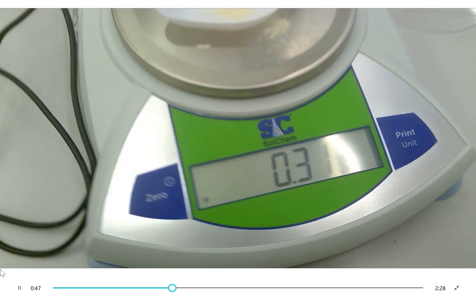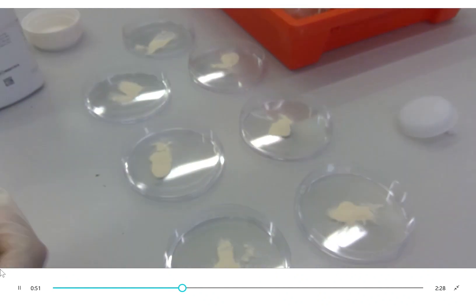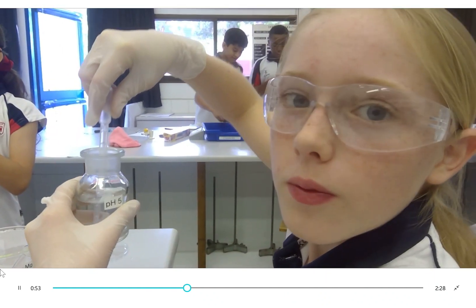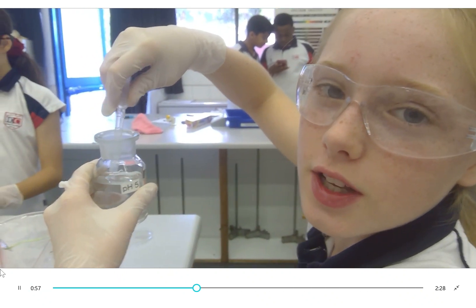You need 0.28 grams of agar powder to 10 millilitres of water, or 10 centimetres cubed. We added 10 millilitres of each substance to the agar powder.